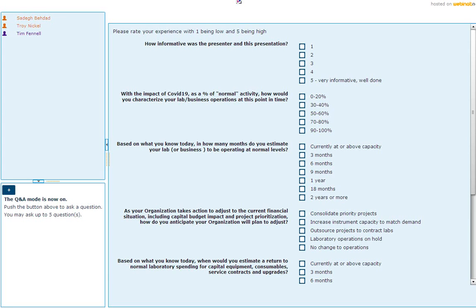Also, very important distinction is that you have the modulated option on our TMA now. So that allows you to separate reversible and irreversible phenomena that is going on together inside your sample.